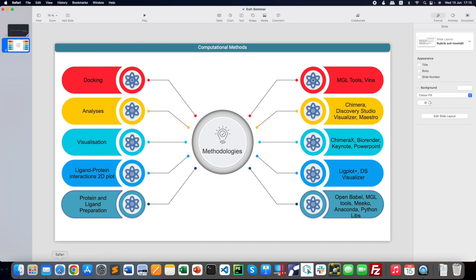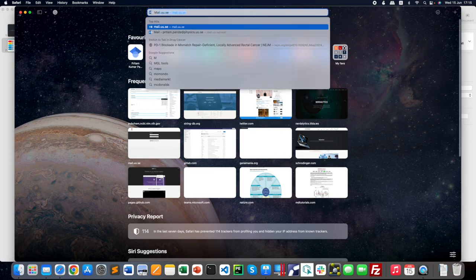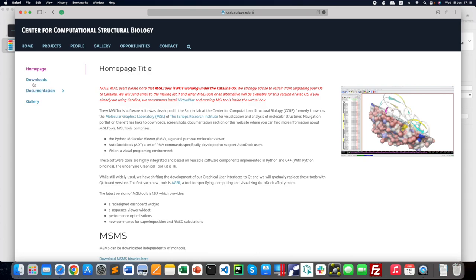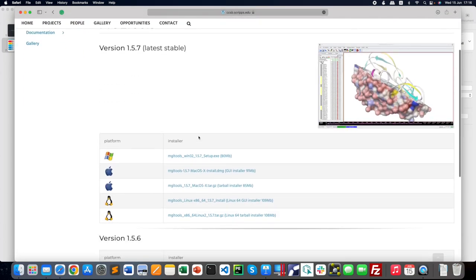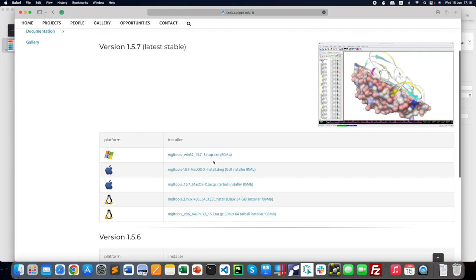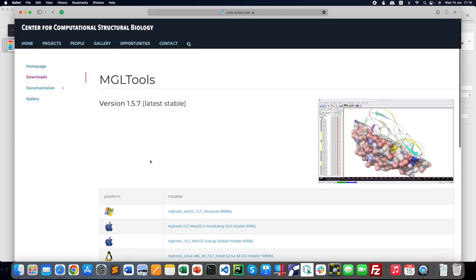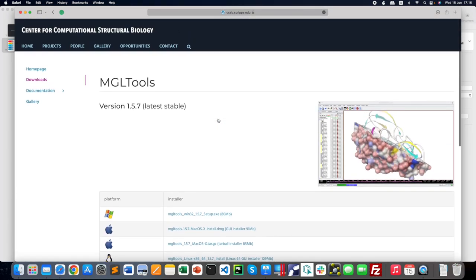The first and foremost software required is MGL Tools. Go to the MGL Tools website from the Scripps Research Institute, navigate to Downloads, and you'll find the latest version. There is a graphical user interface version available for Windows, a tarball installer for Mac, and versions for Linux as well. All three platforms are covered by MGL Tools, which helps you with protein and ligand preparation.